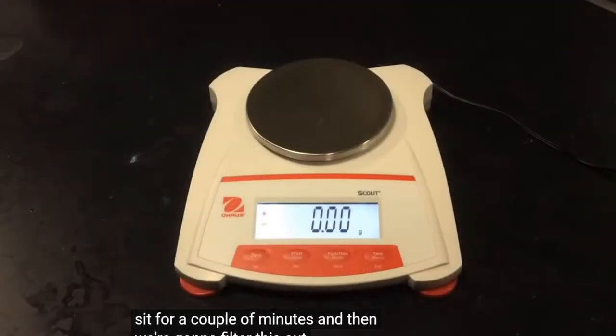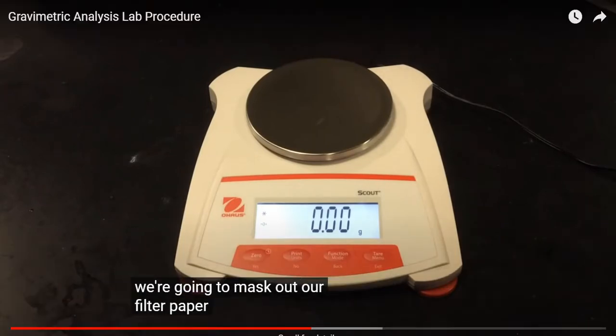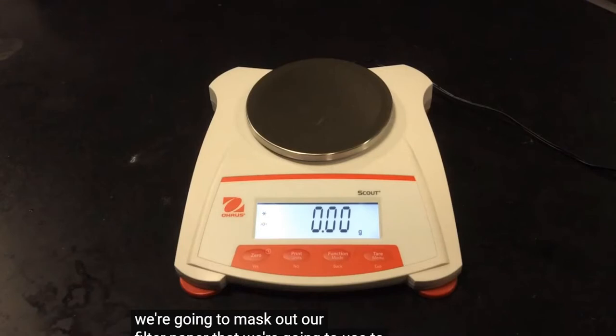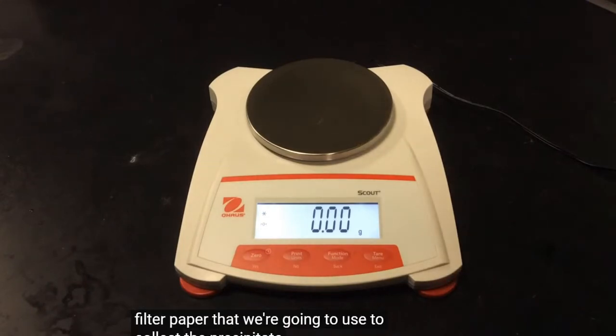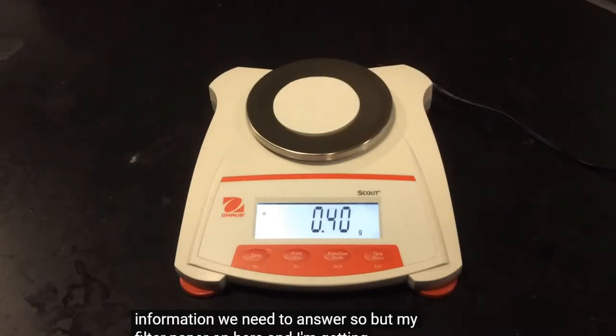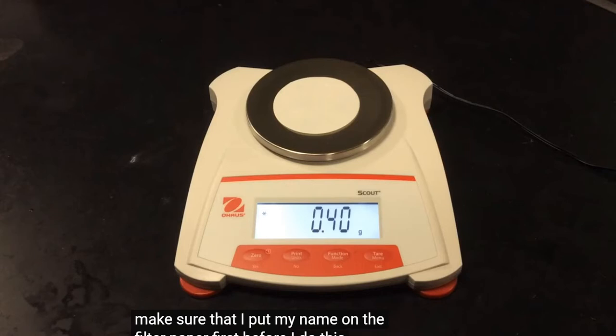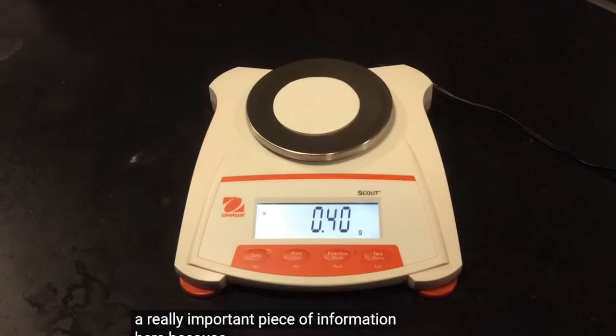Right now, we're going to mass out our filter paper that we're going to use to collect the precipitate that has all the information we need to answer. I'll put my filter paper on here, and I'm getting 0.40 grams. I'd make sure that I put my name on the filter paper first before I do this, because that could add to the mass. And this is our dry filter paper. It's a really important piece of information here, because we collect our precipitate.